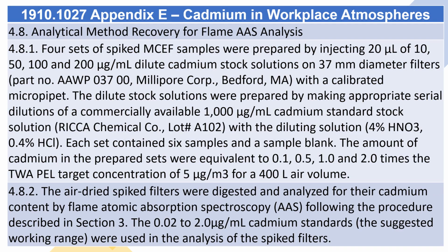4.8. Analytical method recovery for flame AAS analysis. 4.8.1. Four sets of spiked MCE samples were prepared by injecting 20 µL of 10, 50, 100 and 200 µg/ml dilute cadmium stock solutions on 37 mm diameter filters, Part No. AAWP 03700, Millipore Corporation, Bedford, Massachusetts, with a calibrated micropipette.